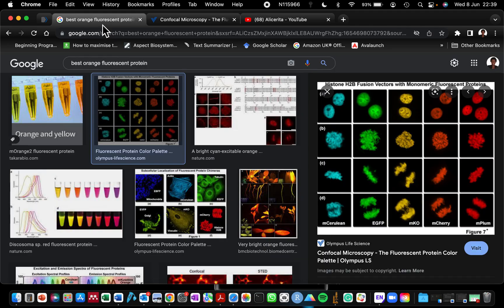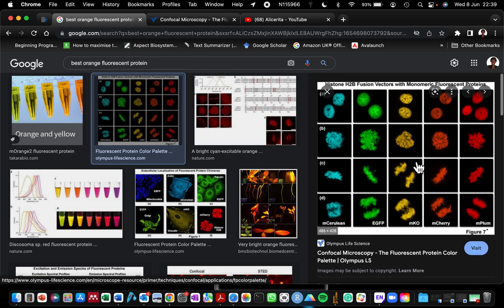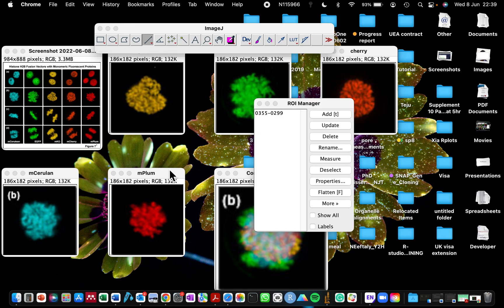Since I've never acquired any images with that number of fluorescence proteins, I searched on Google and found a confocal microscopy fluorescent protein color palette. I downloaded this and I'm going to be using an image from the Olympus microscope website for the purpose of this tutorial.